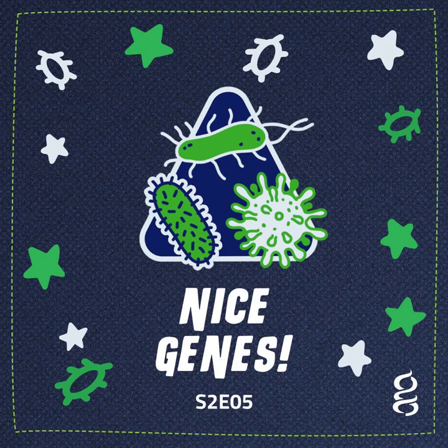What happens once I have gone to collect the poop and it comes here? How do we look for things like the genomics in that poop? Well, once we get it from you guys, we put it in the freezer here, so minus 80 degrees, so it's very, very cold. We pull it out, we thaw it up a little bit, and then I separate out a few of the guano pellets. And then I put it through a kit, a DNA extraction kit.